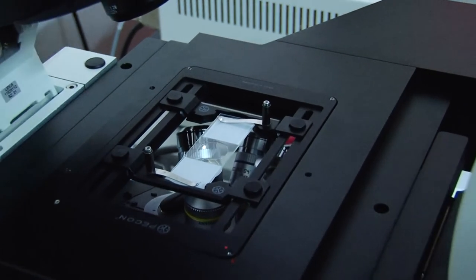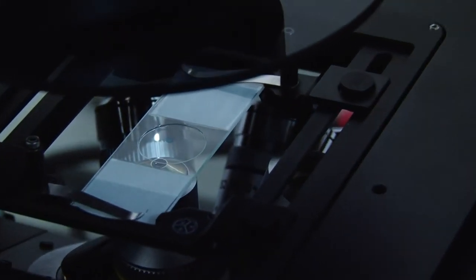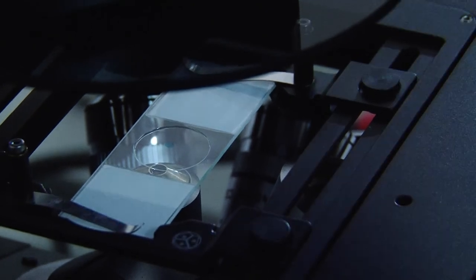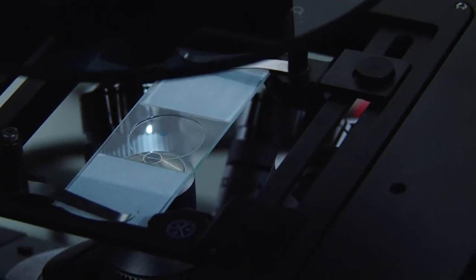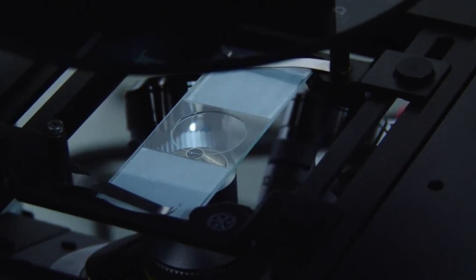Okay. We're going to put this down. And now what you're going to do is move this over. We're going to send the light to your eyes. So hit this one. Push that one. Okay, hit BF for bright field. Okay, and then we're gonna turn the light on, so hit the shutter. Okay, and we're gonna move over a little bit. And right about there, and then you look with your eyes.